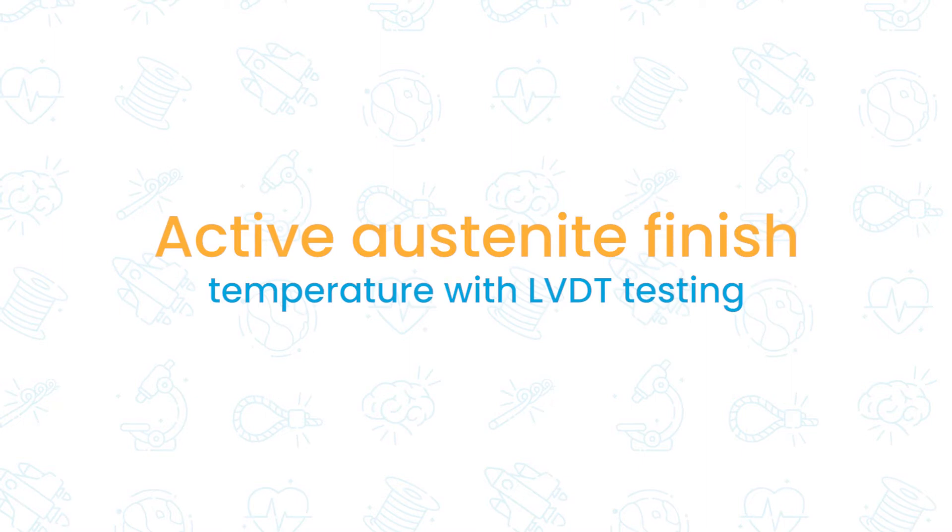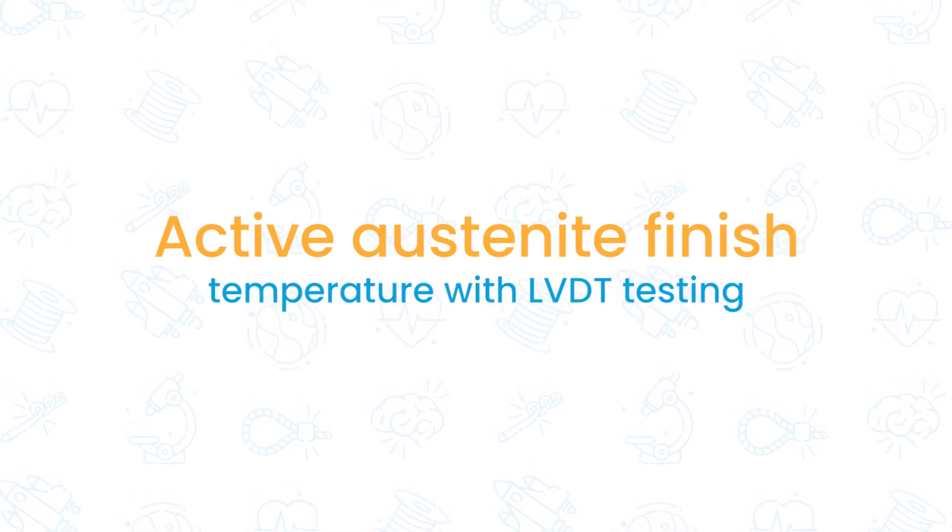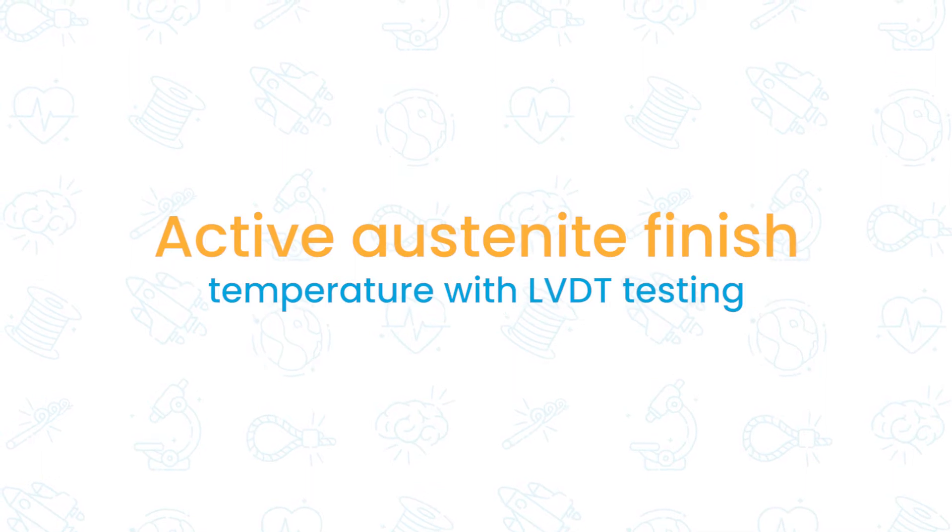Determining the active austenite finish temperature of nitinol wire with a linear variable displacement transducer, or LVDT for short, is an easy way to get fast, accurate readings.